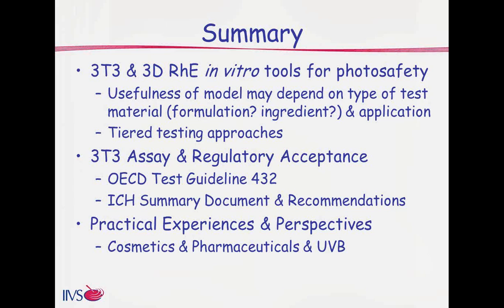All right. So today we spent some time discussing in vitro assays commonly used for photo safety assessments. There's a number of important considerations, including how will your test material be used? Is it an ingredient or a final formulation? How could solubility affect your testing strategy? How will your test material be applied? Systemically, topically? What points would favor one assay over another? How can we use tiered testing approaches? And importantly, how you can use these assays as part of your photo safety testing program.